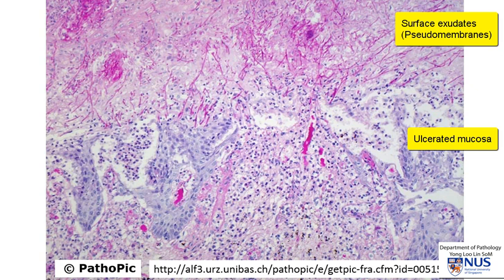This is the appearance of candidal infection. If we only see yeast forms then we can't say for sure that it is an infection. However, if we do see the hyphal forms then this indicates infection.